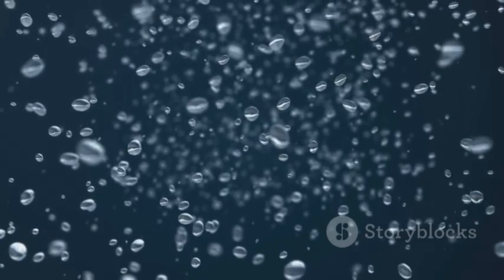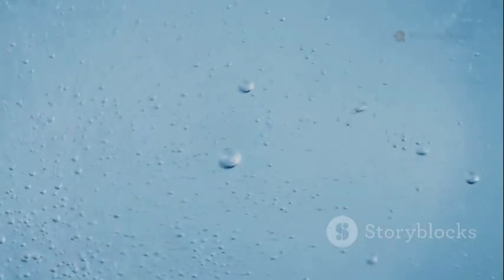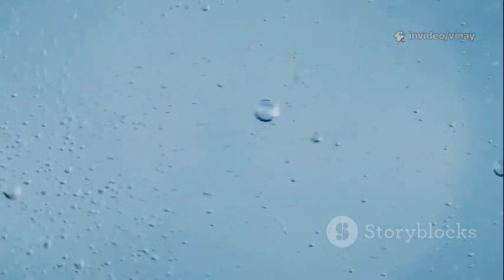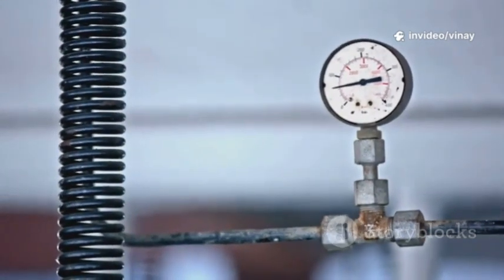Because the filter repels water, the water can't easily pass through the pores. However, under enough pressure, a very tiny amount of water can be forced into the pores of the filter membrane without actually passing through to the other side. This isn't a bulk flow of water, it's more like water vapor penetrating the pore structure. This tiny loss of water from the pressurized side can be measured.